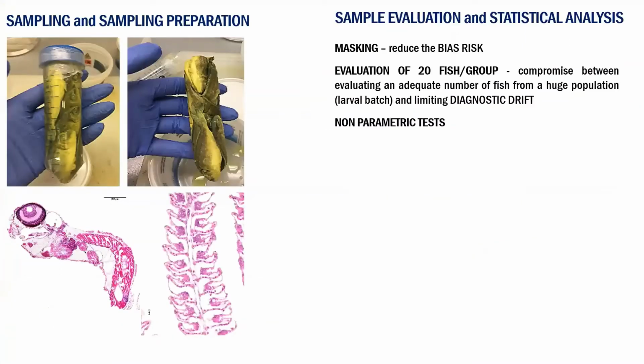I remind you, as I mentioned above, the tissue quality is essential for a successful evaluation. Although a skilled histopathologist can, to some extent, recognize and compensate for flaws in histologic preparations, not fresh or poorly fixed specimens undergo postmortem lysis that partially or totally compromises analysis or leads to artifacts that make histologic evaluation difficult or impossible. I would like to stress again the importance of impeccable histologic quality. It's not possible to receive samples in this condition in the lab and, of course, to then have high quality histological slides.